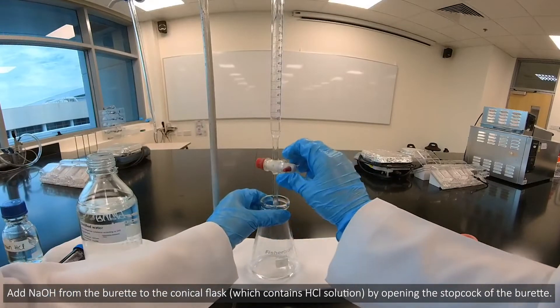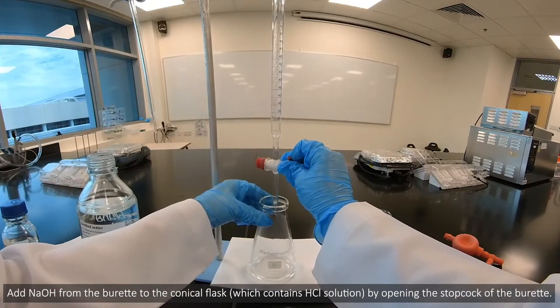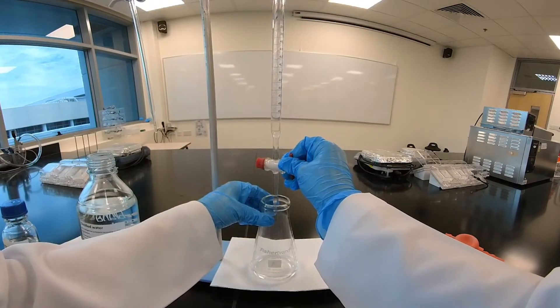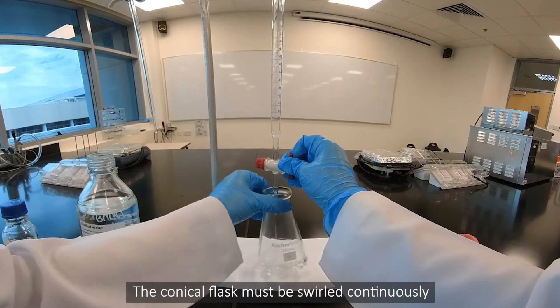Add NaOH from the burette to the conical flask, which contains HCL solution, by opening the stopcock of the burette. The conical flask must be swirled continuously.